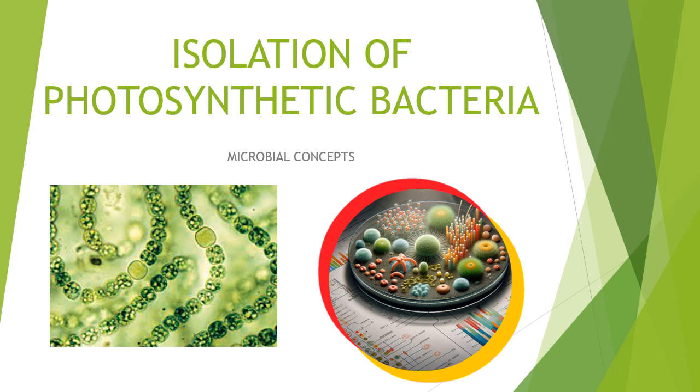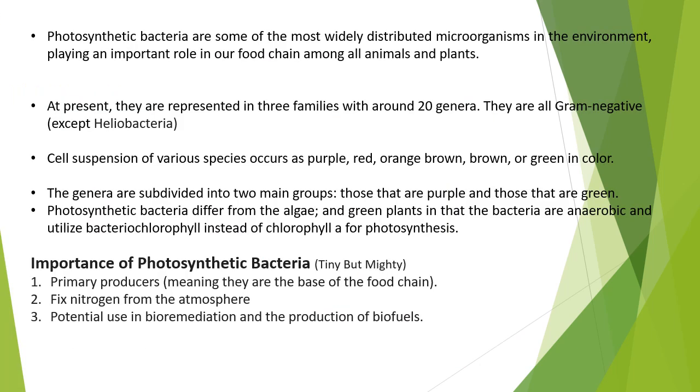So in this video, we are going to discuss isolation of photosynthetic bacteria. Now, I have included both the theory part and the practical part. For a few, this practical is in third year BSc, and for a few you might have it in masters. So according to that, whatever information is necessary for practicals or theory, everything is included here.